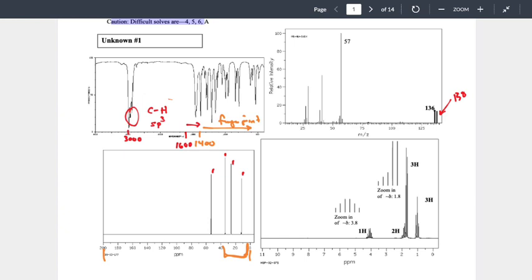So if we now use that documentation with this, the graph says between 0 and 50 is alkane. Those are alkanes. This one isn't in that range. That's outside the 0 to 50. How do we want to interpret this? That would be the carbon attached to the bromine. Okay. I'll come back to that later, just for the record.